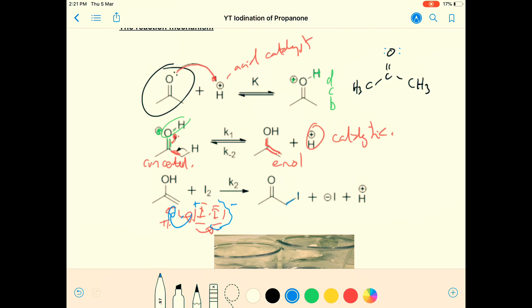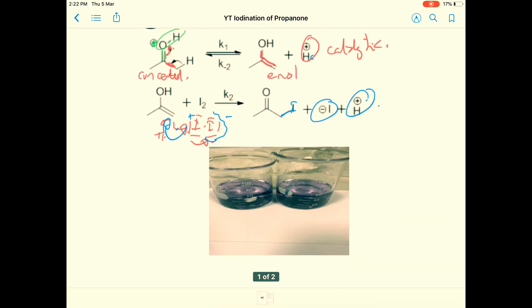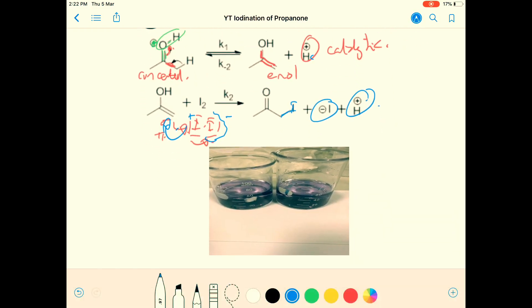We attack on the end and form our iodinated propanone. One of the iodines has gone, I minus is liberated, and the H plus is regenerated — our catalyst. This is above and beyond the needs of IB chemistry, but if you're thinking of doing this as an IA, what a perfect way to make it personally engaging and show your exploration. This practical is an honest account of what happened when I did it, which you are about to see now.